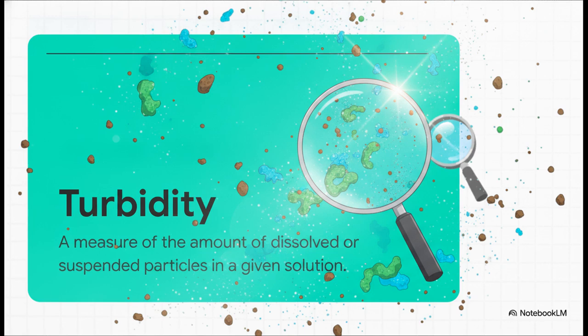We're detecting how much invisible suspended matter is just floating around in a sample. We're talking clay, silt, finely divided organic matter, or even microscopic organisms like plankton and algae. Basically, the more suspended solids you have hanging out in the water, the less clear it's going to be, because those particles physically block and scatter the light.